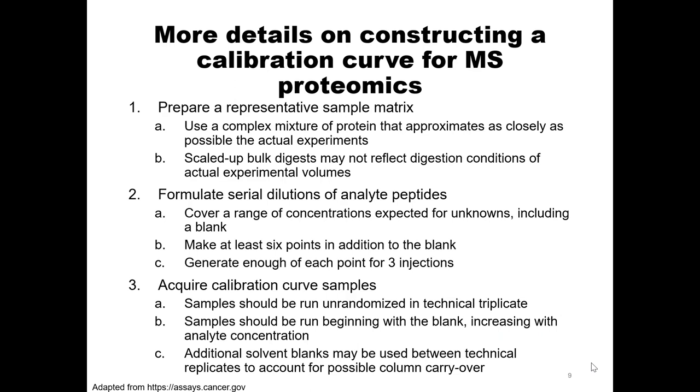But that sets me up pretty nicely for getting into computational analysis. So this is going to be available to you in the slides, and it's just a written version of everything that I just said, in case you're venturing into calibration curves. It's all the things that I just said verbally. Make at least 6 curve points, generate enough of each point for 3 injections, and so on.